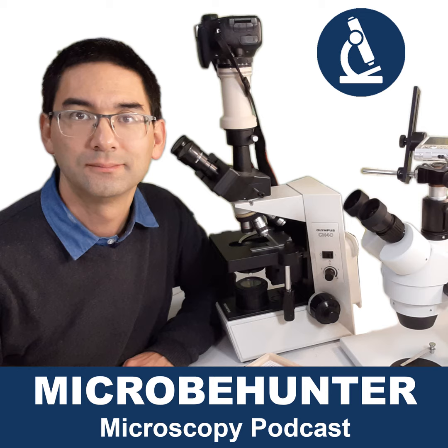So I wanted to say here that in order to do this, you need more information, and you cannot go directly from the assumption that you have some kind of parasite to the microscope. It's got to be more specific than that, and then you can use, under some circumstances, the microscope as a last step to actually confirm it if you see it. But not right here at the beginning. So this is a little bit the strategic issue that we have here.